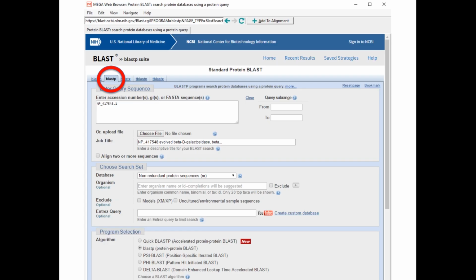and bring up the search page, except we're going to click on BLASTP, so we're doing a BLAST protein search. We're going to search the protein database with protein sequences. This is the accession number for the EBGC protein. That gets put there. It fills that in automatically. I choose as a database the non-redundant protein sequence database. Again, here in the pull-down menu, you can choose that.